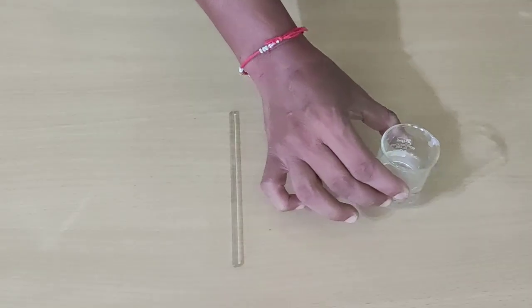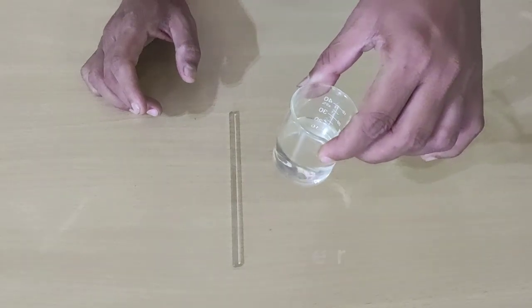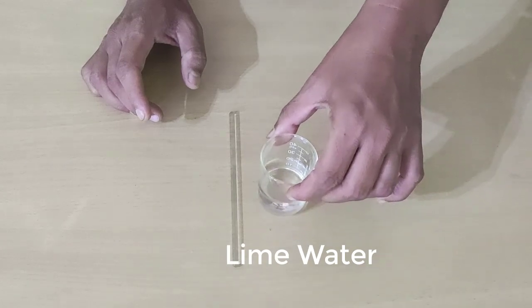Now you can see we have got a colorless lime water solution after filtering through a filter paper.